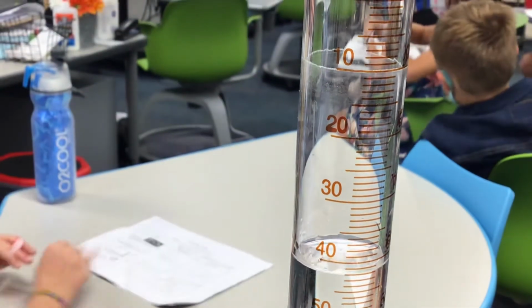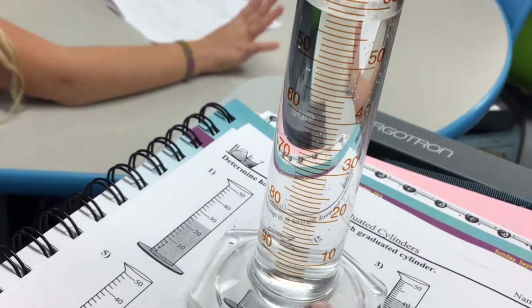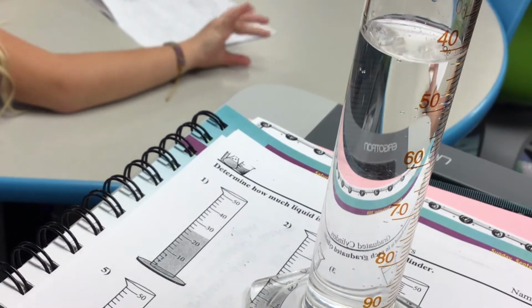But which scale am I going to use? Am I using the scale that is going up, or am I using the scale that's going down? Going down. Yeah, this is 0 down here, so that would have been 0, and that's 0, right? It's not 100. If we had nothing in there, it wouldn't be 100, would it? It would be 0.